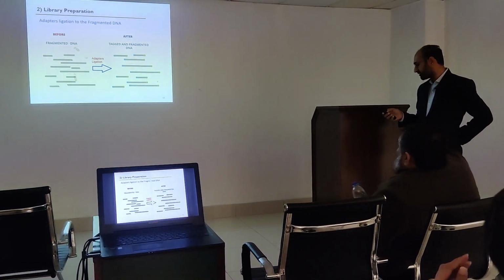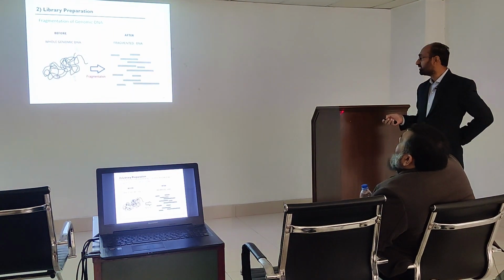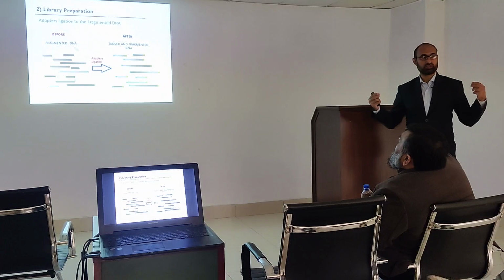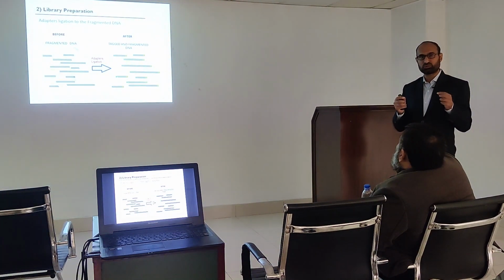This is the A-tailing step. So this is the fragmented DNA, right? We have to join the adapters at both the ends. Right. So for joining the adapters, we have to prepare the ends, doing A-tailing.